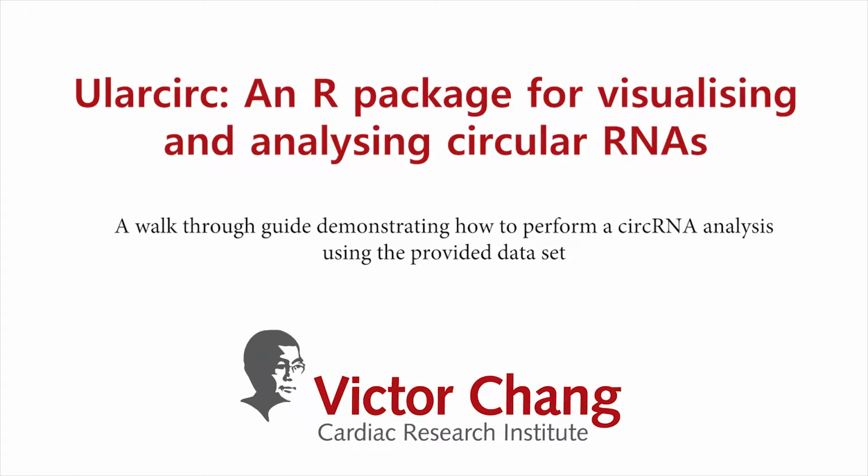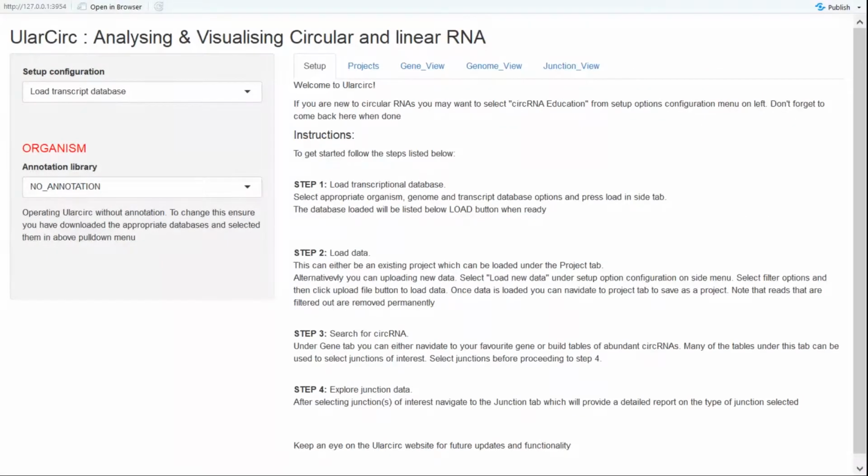Welcome to this Ularcirc screencast. This software was written to help researchers analyse and visualise circular and linear RNA transcripts from high throughput sequencing datasets. This screencast provides a walkthrough introduction on how to use Ularcirc for a simple but powerful bioinformatic analysis.